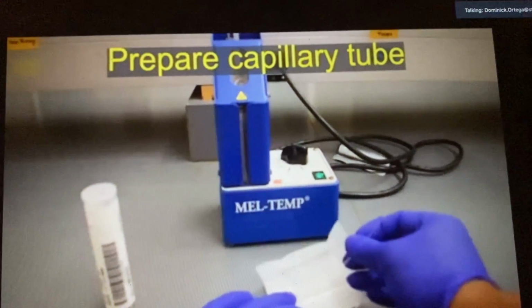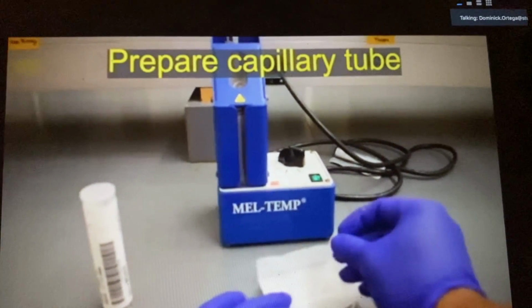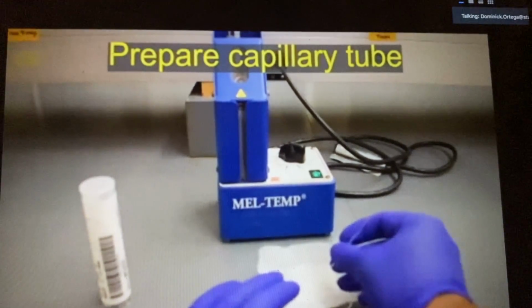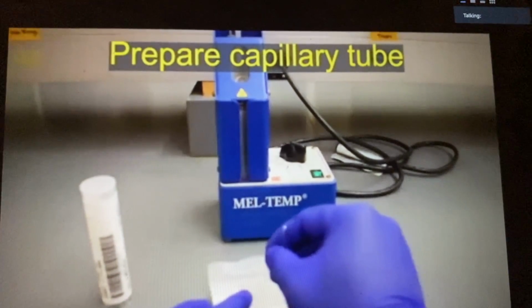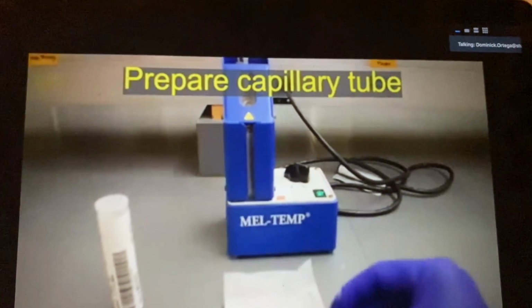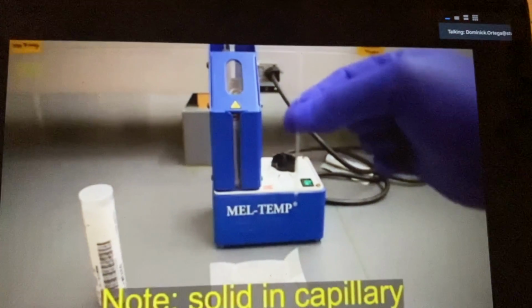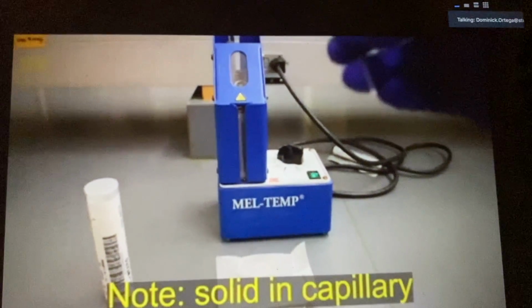Then you're just going to dab a bit of your crystal, push it down, turn it over, and then push it down. You can see it's in the bottom when you put it through the slit in the machine.